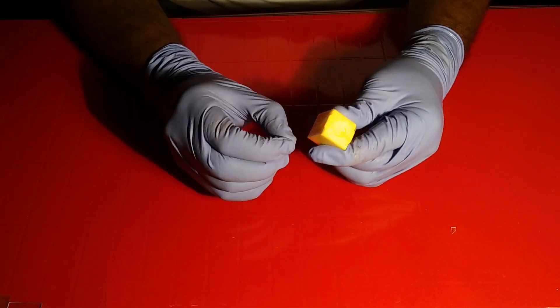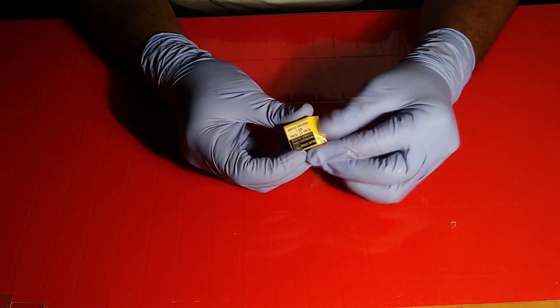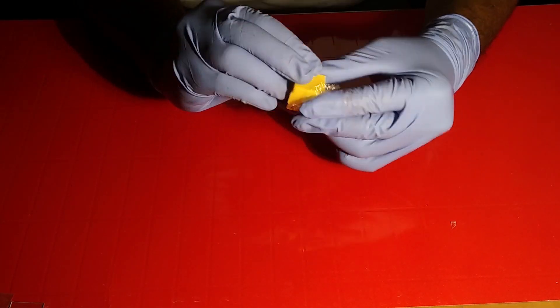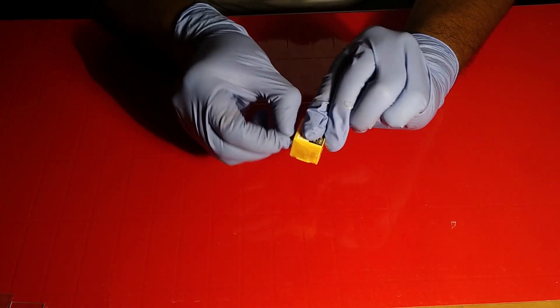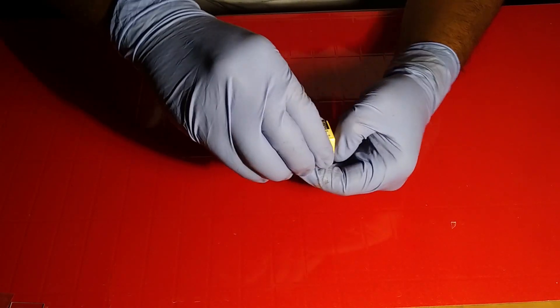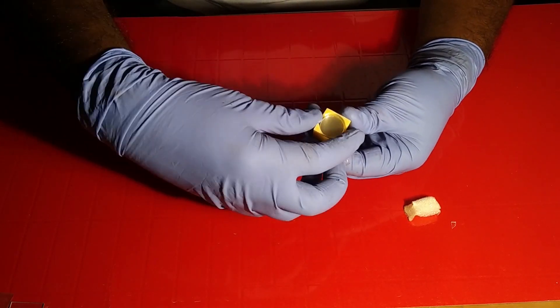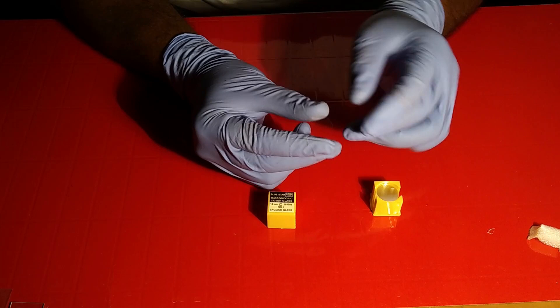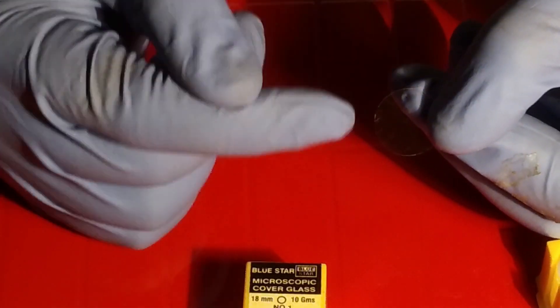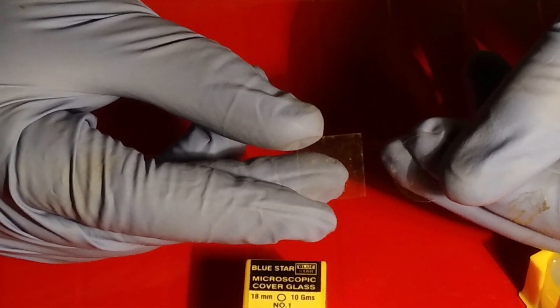Next is another type of cover slip — the circular one. If we are having a practical session on squamous epithelium and need to collect squamous epithelium, a square cover slip will not give the required results. In that case, the circular cover slip will work. Now we have a comparative view of the square and circular cover slip — students are supposed to be familiar with both types.